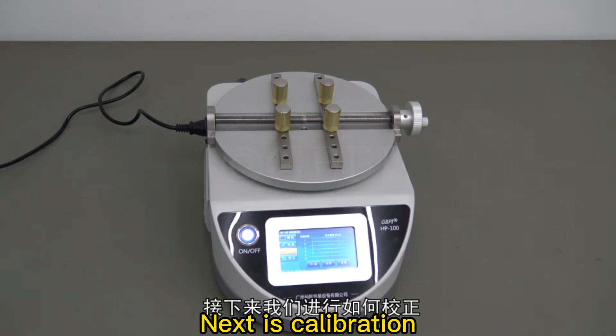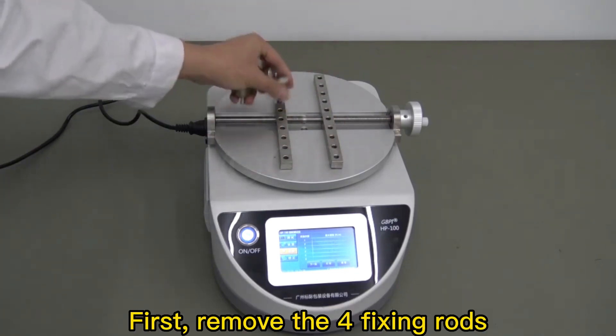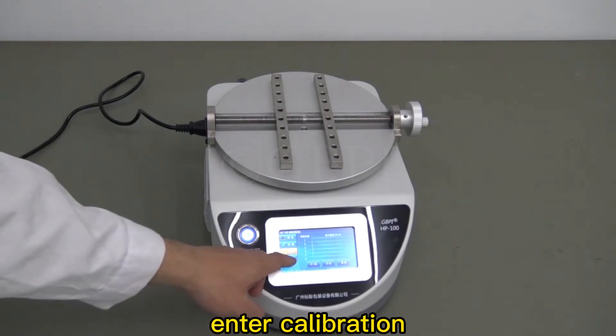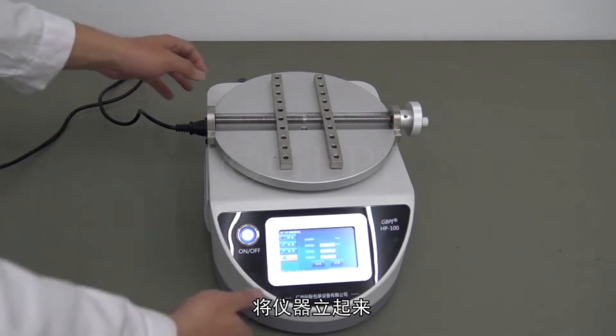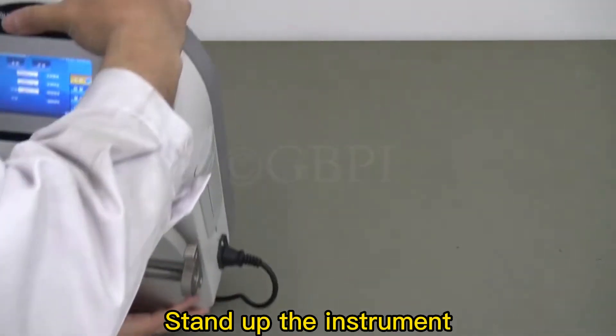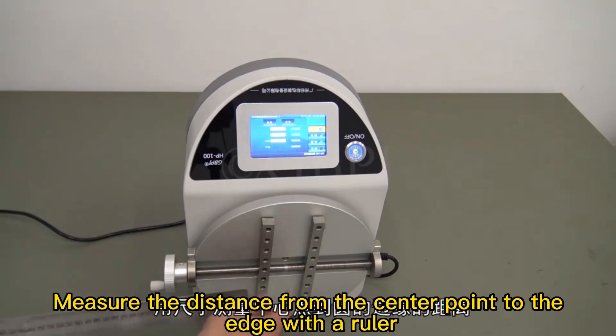Next is calibration. First, remove the four fixing rods and enter calibration. Stand up the instrument, then measure the distance from the center point to the edge with a ruler.